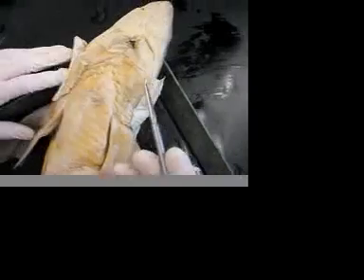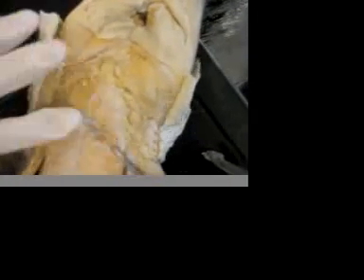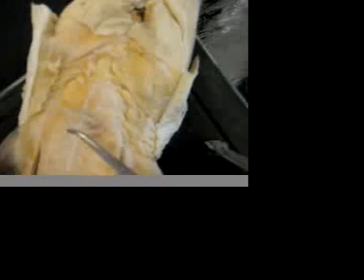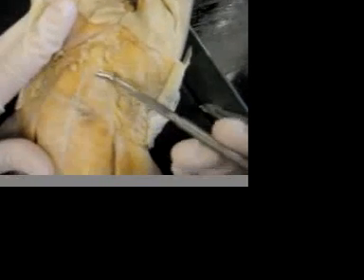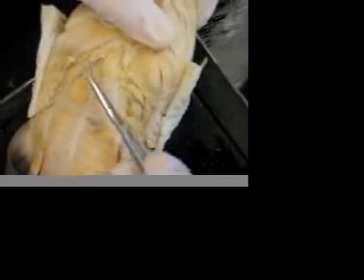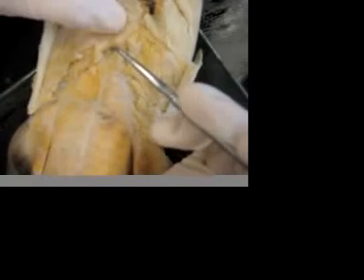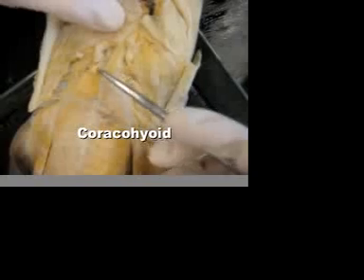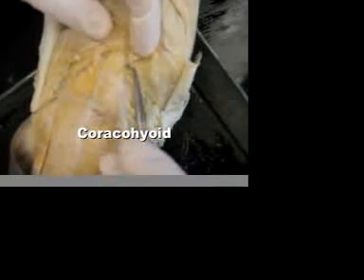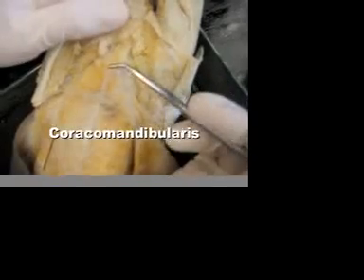Looking at the head region, here is the coracoid bar right there. If you push on it, it's really hard, and you can see that on the skeleton as well. Directly anterior to that is the common coracoarcuale. Coming up from the coracoarcuales on either side, you can see the coracohyoid on this side and also on this side. And in between the two of those is the coracomandibularis.